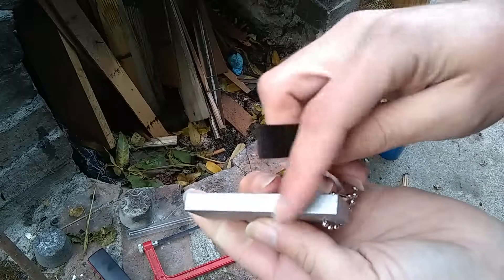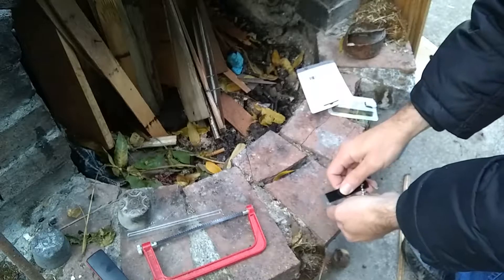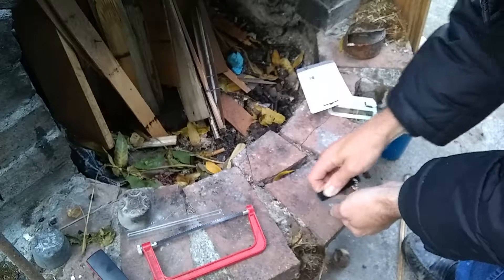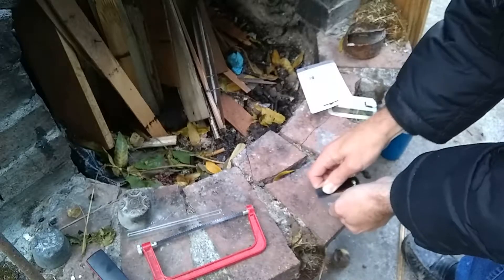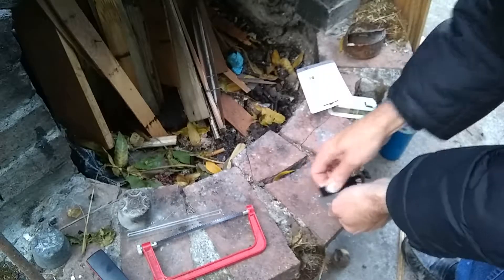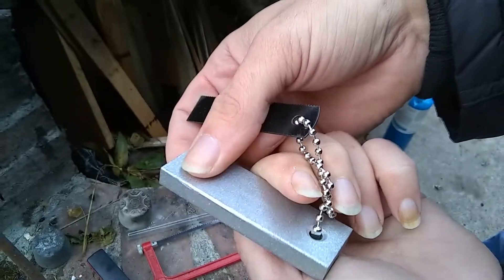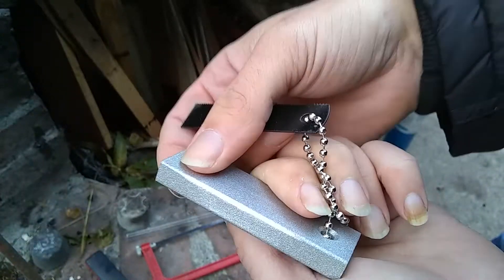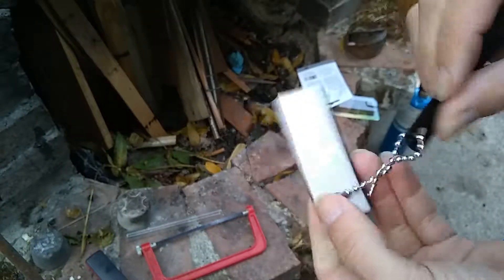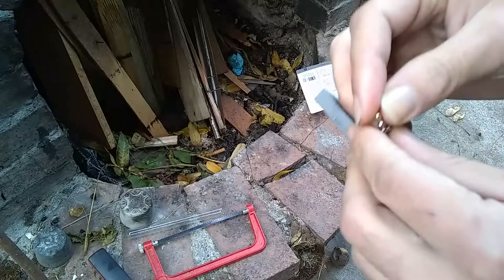First, look at the edge of the metal. It's moderately shiny. And as I scrape some of the metal off, it gets a lot shinier. It's because magnesium tarnishes easily in air. And when you scrape the tarnish off, it's very shiny underneath.